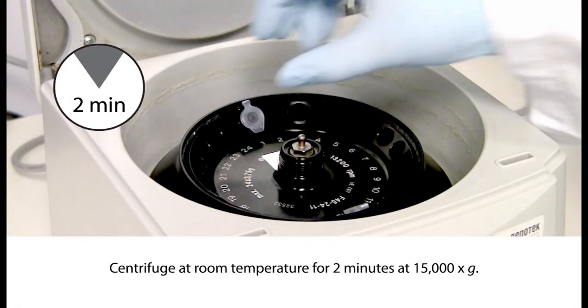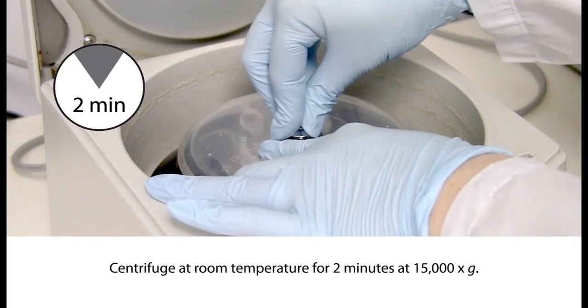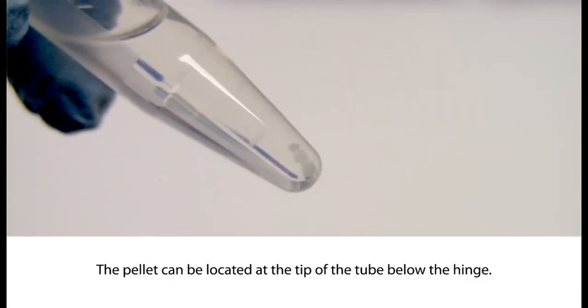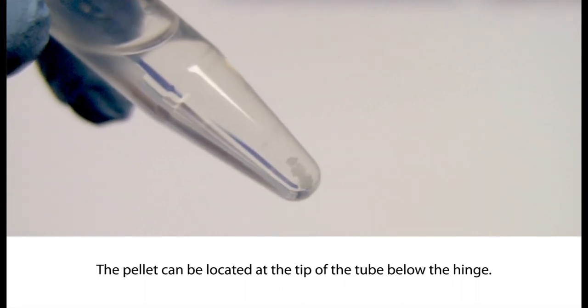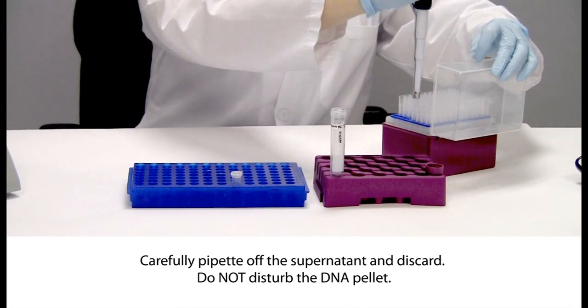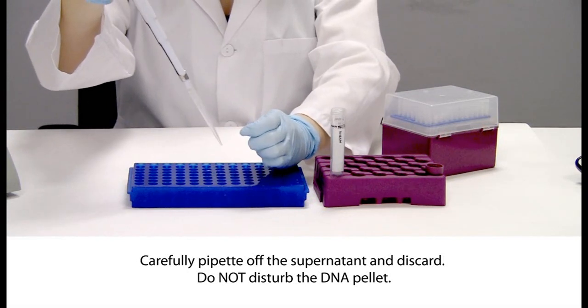Place the tube in the centrifuge with a known orientation. Centrifuge at room temperature for 2 minutes at 15,000 times G. For example, place each tube in the microcentrifuge with the hinge portion of the cap pointing away from the center of the rotor. After centrifugation, the position of the pellet can be located, even if too tiny to be easily visible, at the tip of the tube below the hinge. This pellet contains DNA — loss of the pellet will result in loss of the DNA. The supernatant may contain impurities and should be removed as completely as possible. Excessive drying of the pellet can make the DNA more difficult to dissolve. Carefully pipette off the supernatant and discard it, taking care to avoid disturbing the DNA pellet.